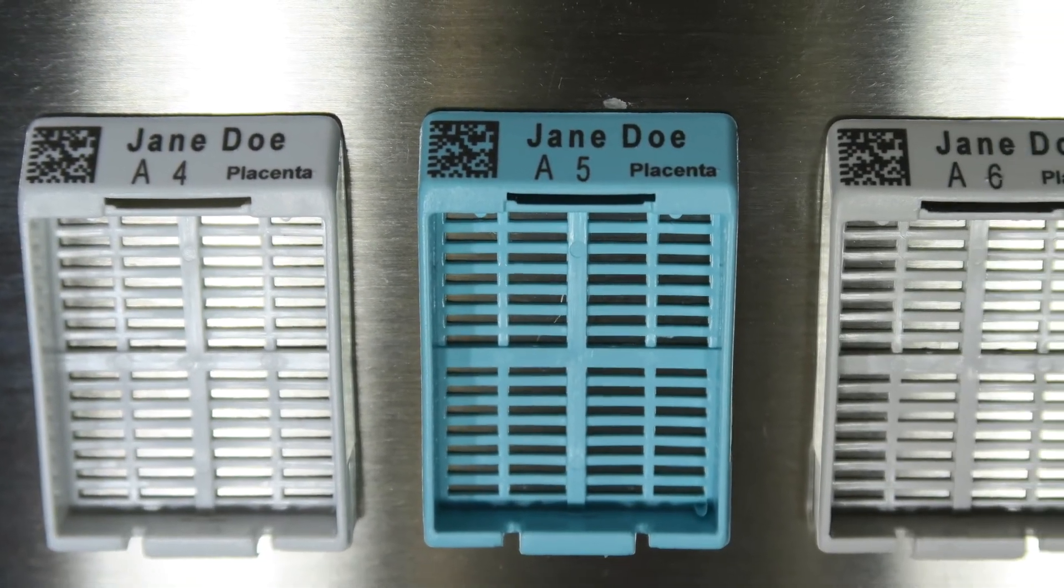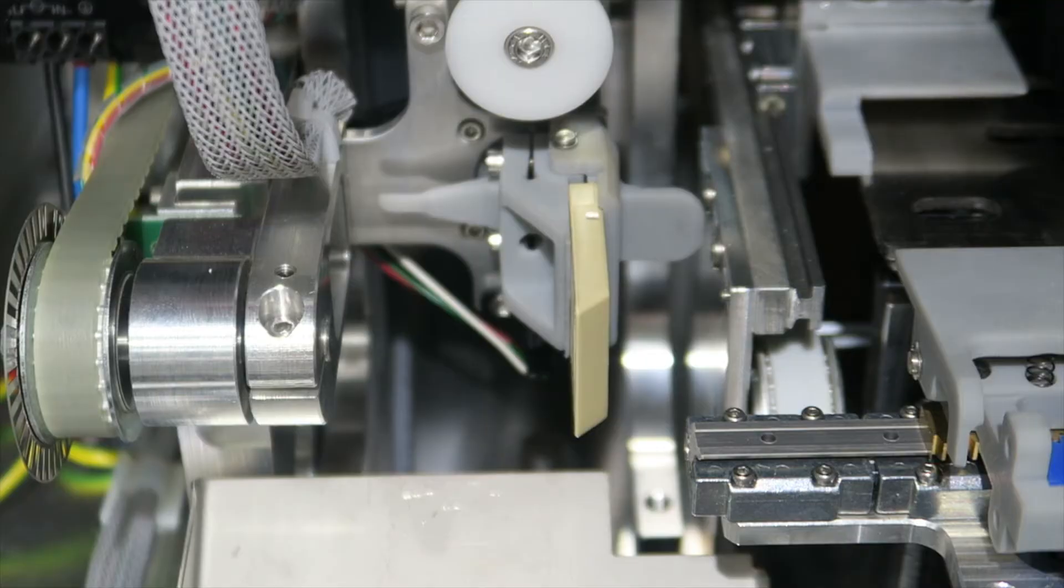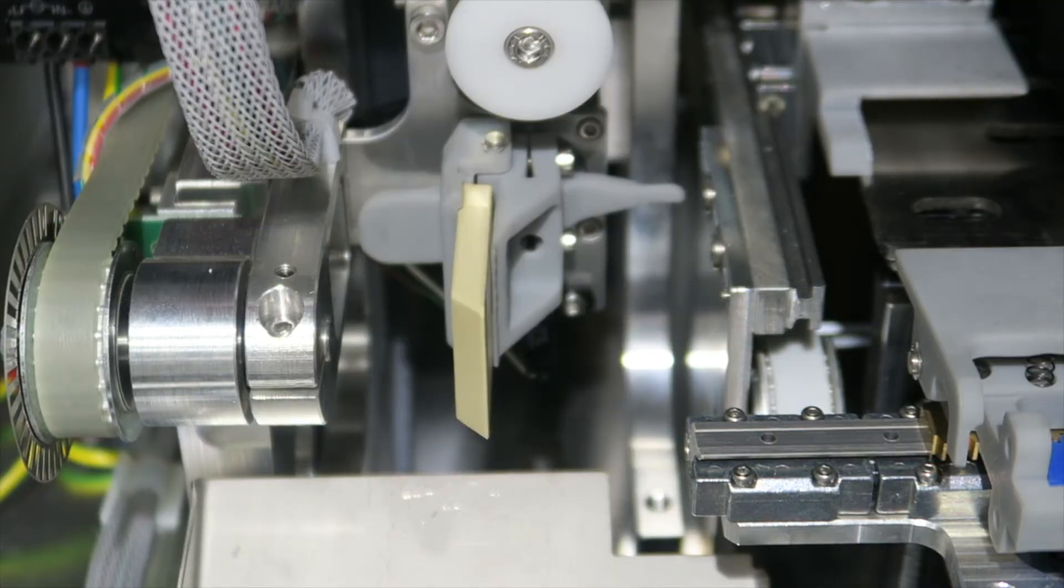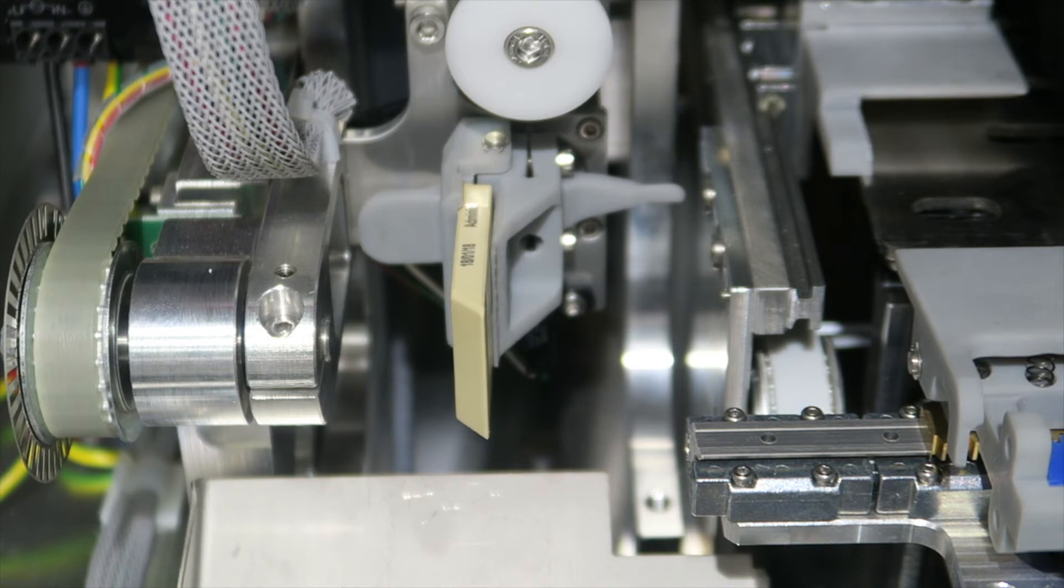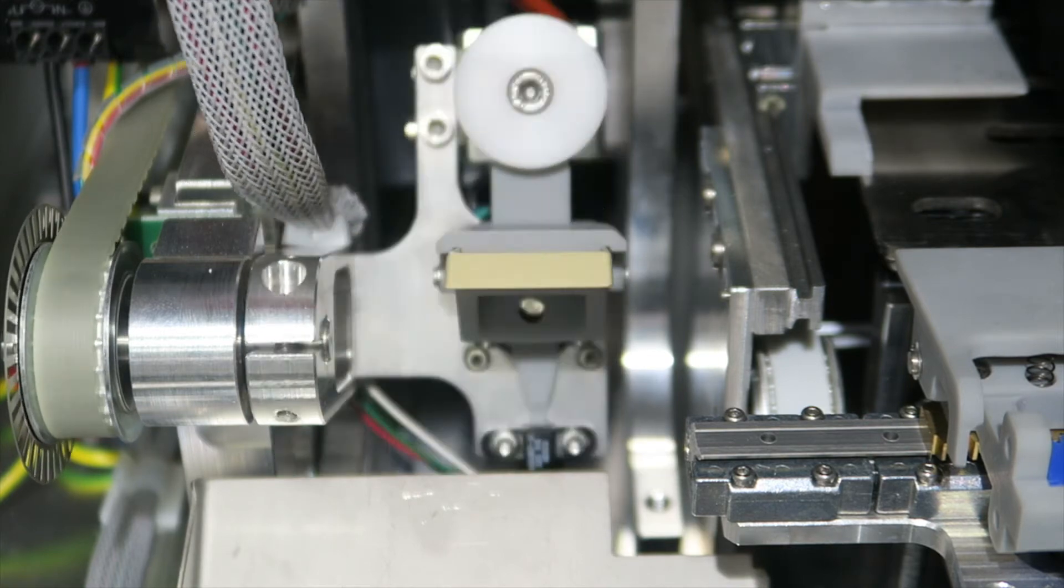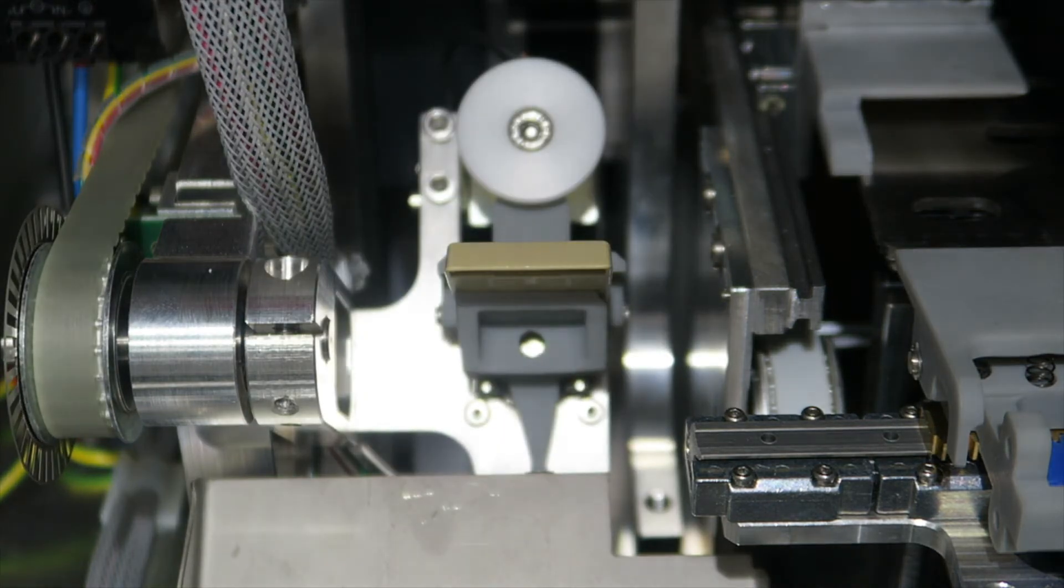The PH-8 is the only cassette printer capable of printing on one, two, or three sides of the cassette to include as much information as necessary for protecting patient identity.